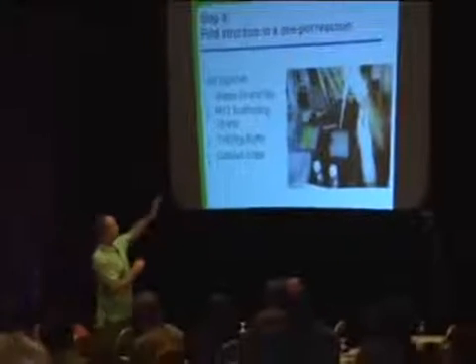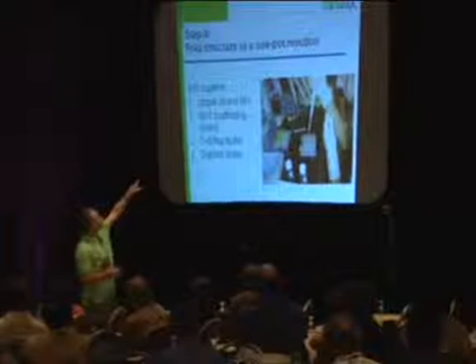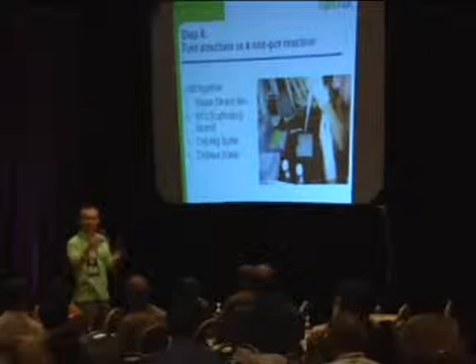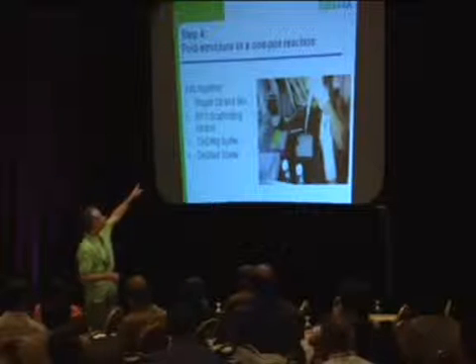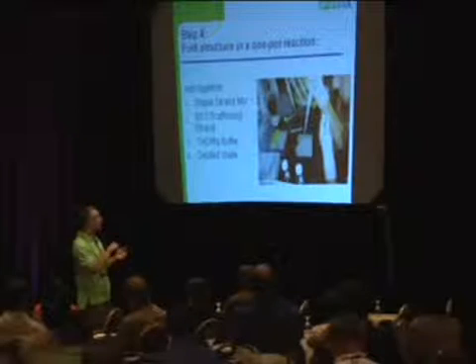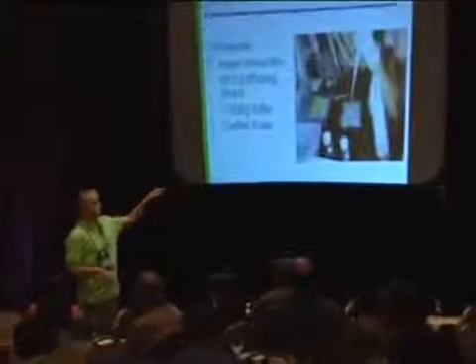So what? Basically, here's the recipe for creating origami. You take your staple strand mix, which has your hundreds of strands that Erica, my daughter, just mixed together. You take the M13 scaffold strand, that's in a little tray, and you mix that in. You add some magnesium buffer and distilled water. You mix it up really good.